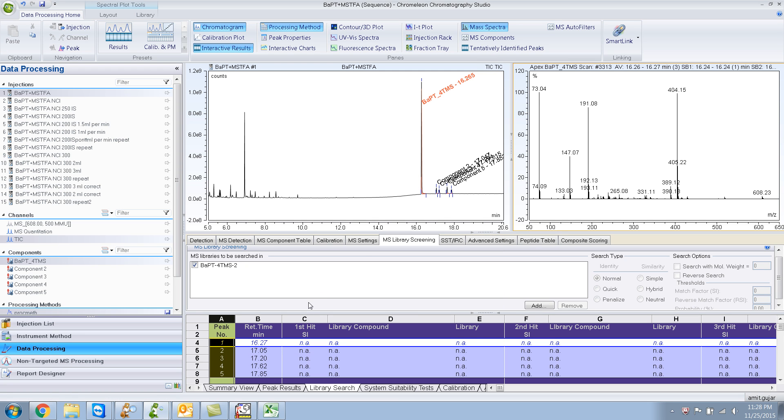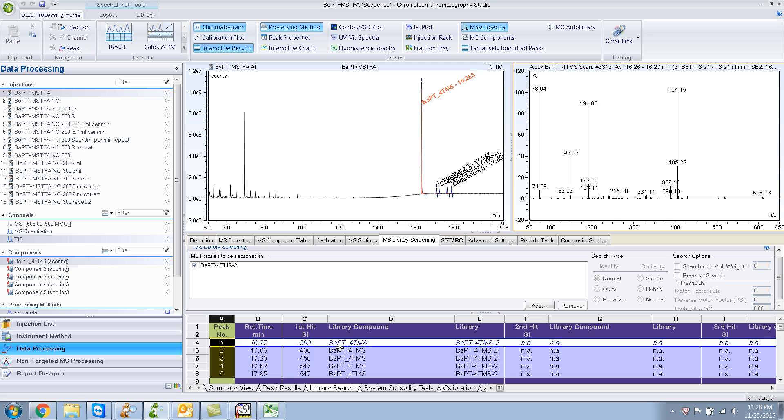So if I refresh this, if you press F5 it will refresh. It gives me a good match 999. So hopefully by my mistakes you understood how to create your own library.